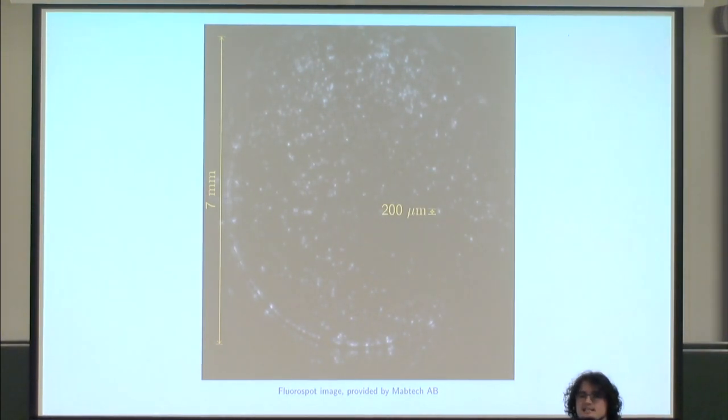But of course this is an ill-defined problem, because you say, what is exactly a spot? Does it have a precise location? Does it have a size? So what we really have to do is to find active cells. And active cells are defined as cells that generate a certain kind of particles the assay is tuned to detect.